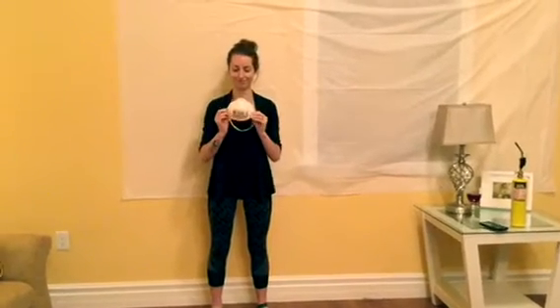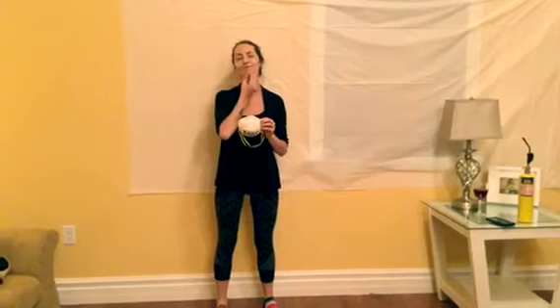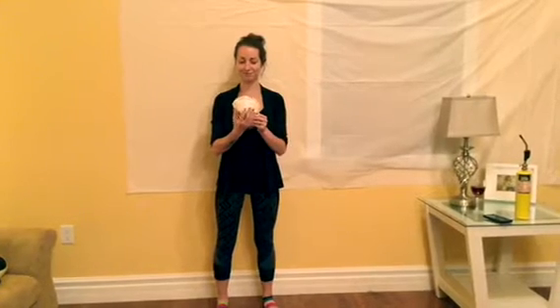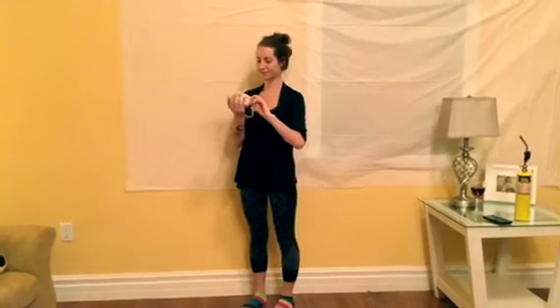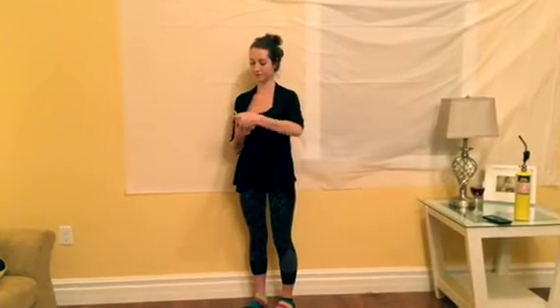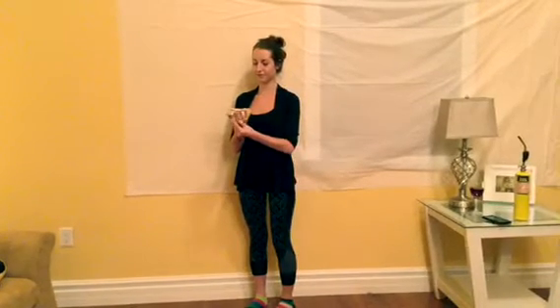If the wearer has a beard, a proper seal may be unattainable. In this event, you must shave. To put it on, hold the mask in the palm of your hand with the nose piece at your fingertips and the head straps hanging freely below your hand. Position the N95 mask to your chin with the nose piece up.